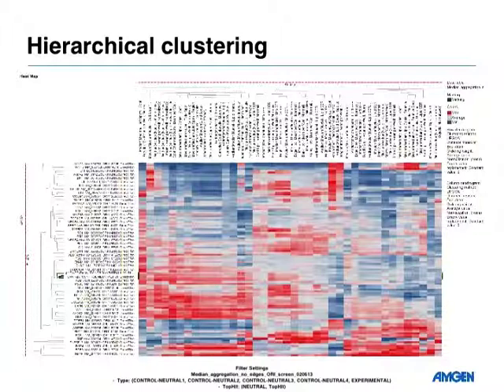In terms of hierarchical clustering, there are basically two different ways of looking at it. One is that you clump everything together and split from the top, saying this group of things is different than this, and you end up with a tree of splits. Or you could start from the bottom, where everything is different, look for things that are similar, and group those together.